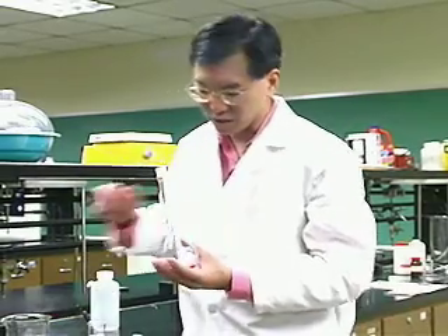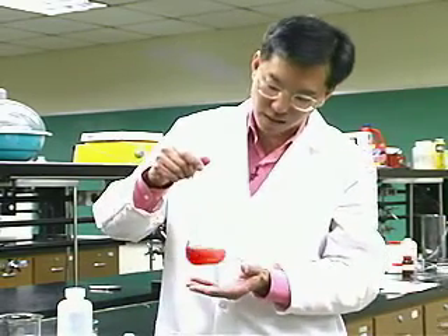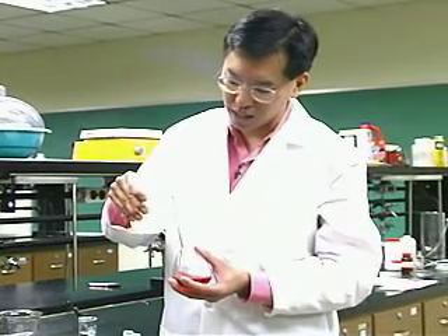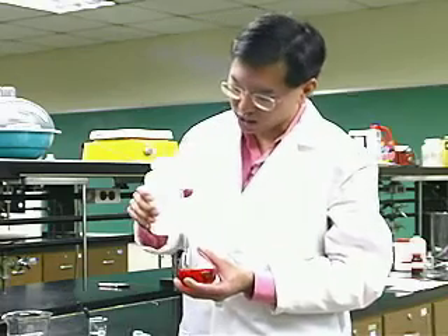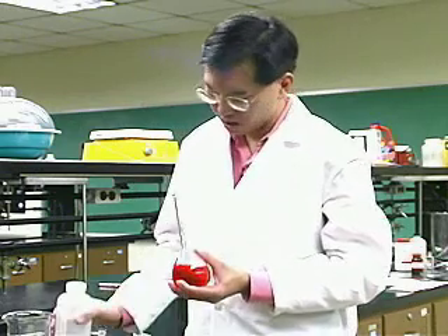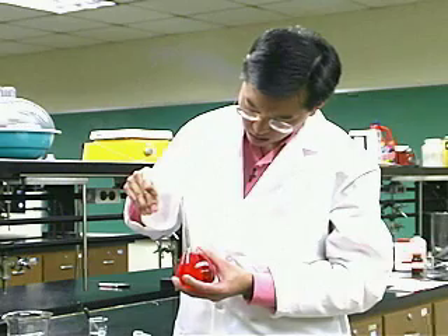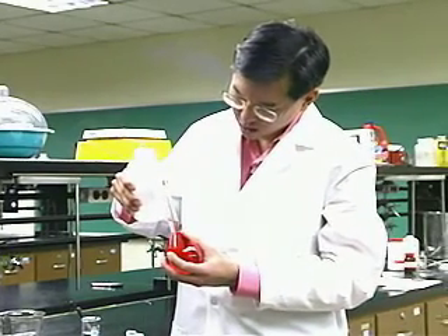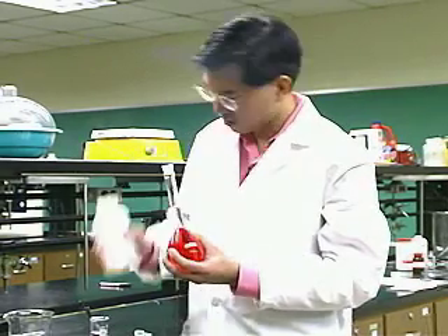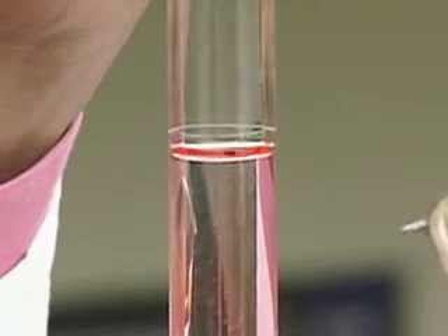Now we have our volumetric flask with 20 milliliters of red liquid, and we're going to dilute it up. This is distilled, deionized water — you don't want to use tap water because it has all kinds of impurities. Add some water and swirl it around. If the densities of the original solution and the water are very different, add water and swirl to make sure it gets thoroughly mixed. Once it gets close to the line, you have to be more careful. Use an eyedropper to bring the level exactly up even with the line.